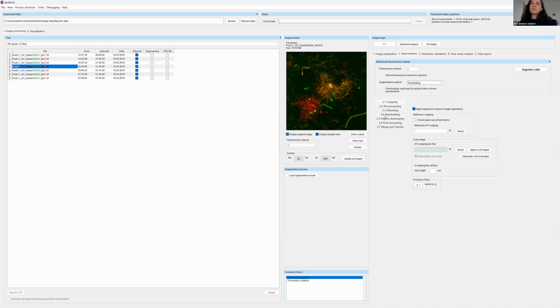And then here we have the different steps that you can do for the segmentation. You have pre-processing, so you can denoise, you can correct for certain things that your microscopy setup might have. You have the thresholding, the declumping, where you can select the cube size, where you can basically dissect your volume into the cubes, and you have the post-processing, in which you can again correct after having segmented for issues that you might have.